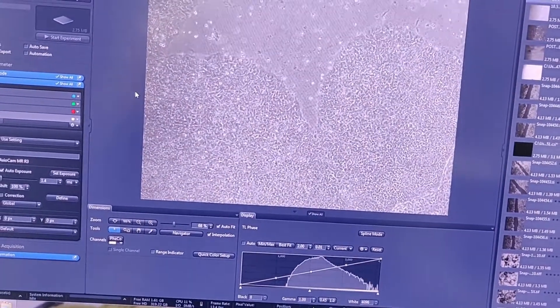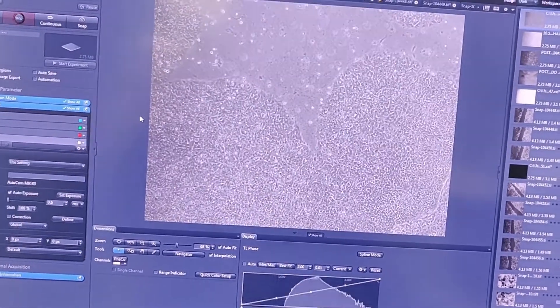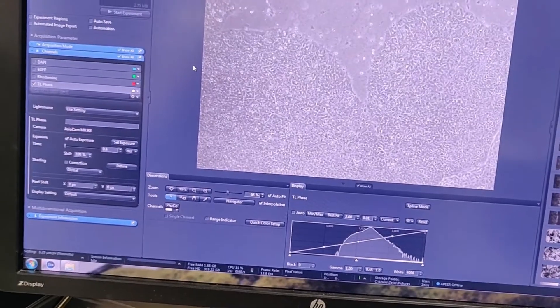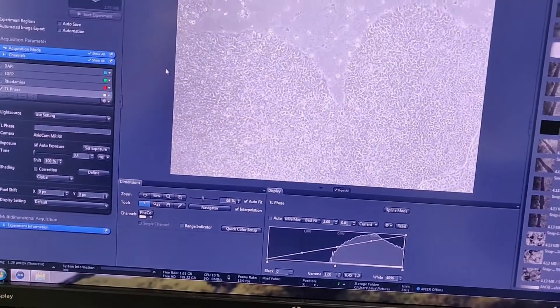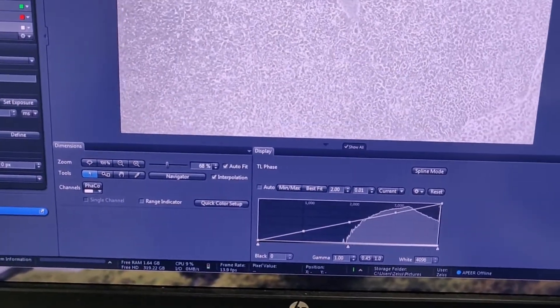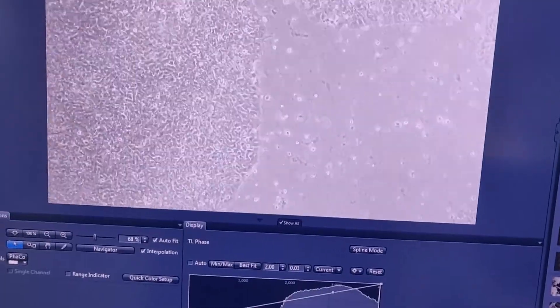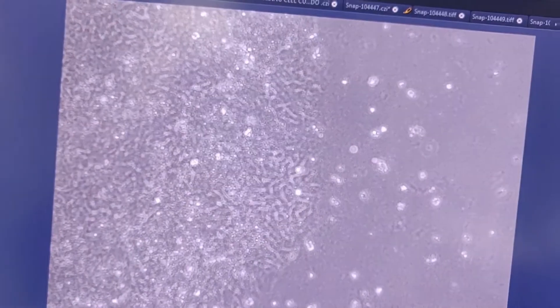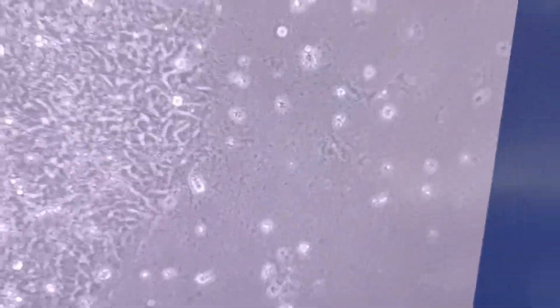So, let me make it a bit brighter. Yeah, perfect. So, as we can see, there are a lot of cells. These all are population of the cells, which are a lot. But if you notice, there are little dot like structure. These dots. So, of course, this is 5x magnification, we cannot see anything on 5x. But when I move to 10x, the cells become a bit bigger and the dots are, you can see that they are moving.